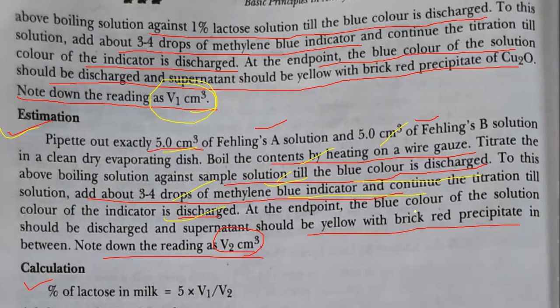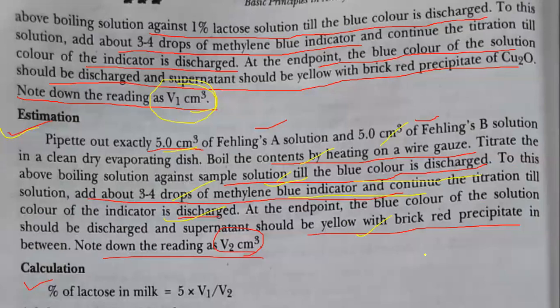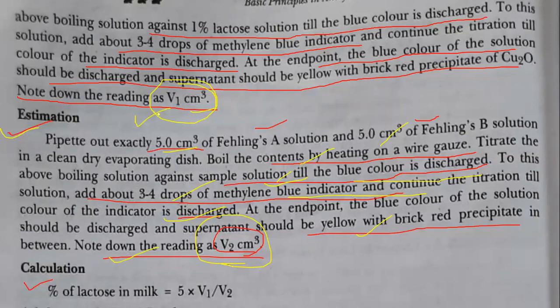At the end point, the blue color of the solution is discharged, and the supernatant should be yellow with a brick red precipitate. Note down this as reading V2. So the reading V1 was for standardization of Fehling's solution, and V2 was for the estimation. The percentage of lactose in the milk is 5 into V1 upon V2.